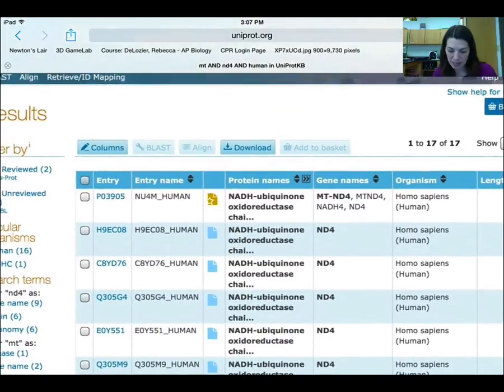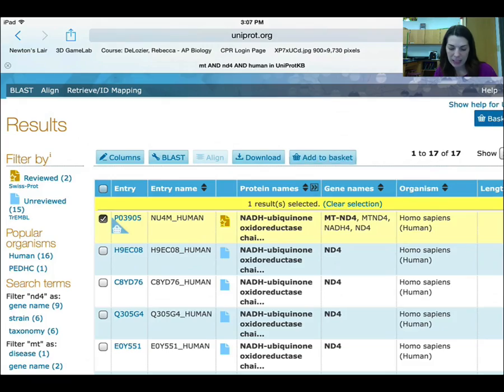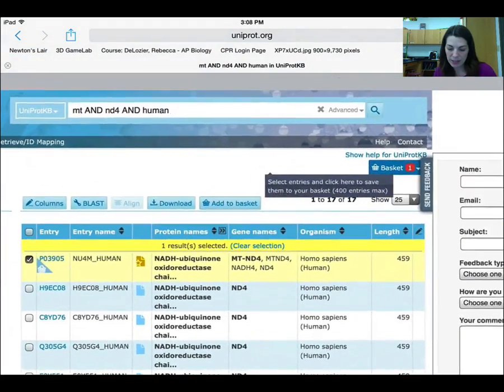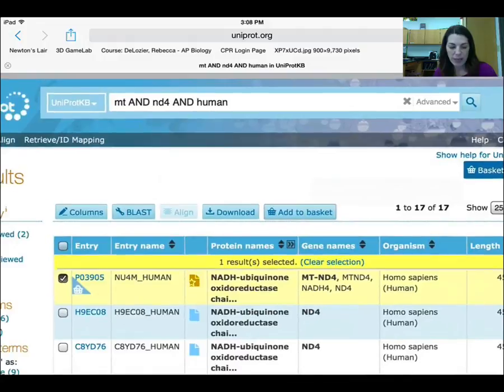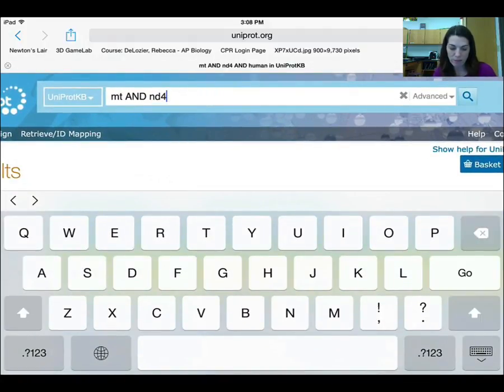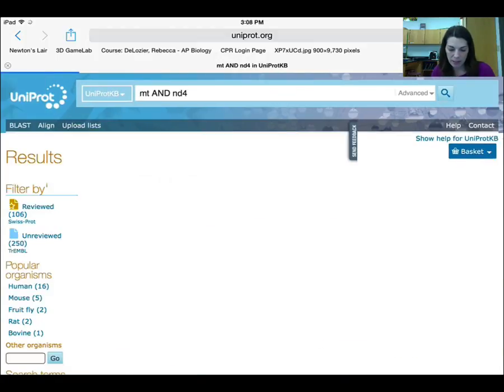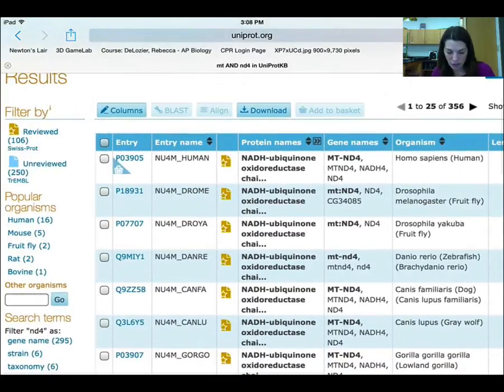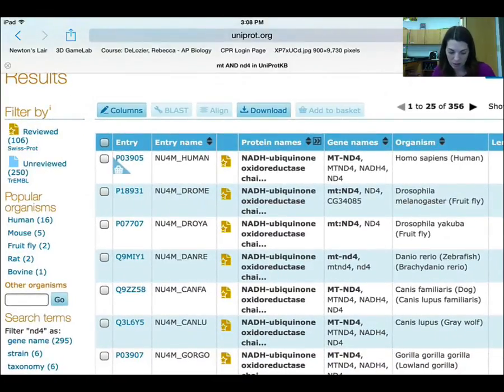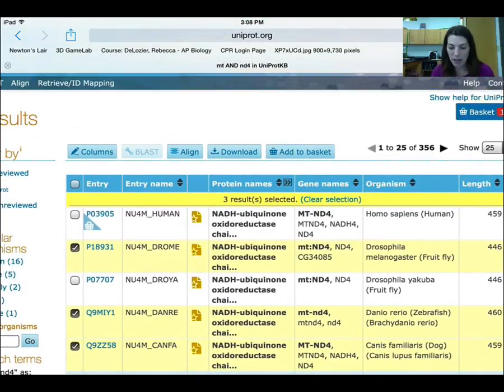That's going to give me my gene right there. I'm going to select it and then add it to the basket, which will save it for later. Then I'm going to look for three sequences that are not human and select three at random — you need to choose the ones that are your other sequences. I'm going to take dog, zebrafish, and fruit fly.